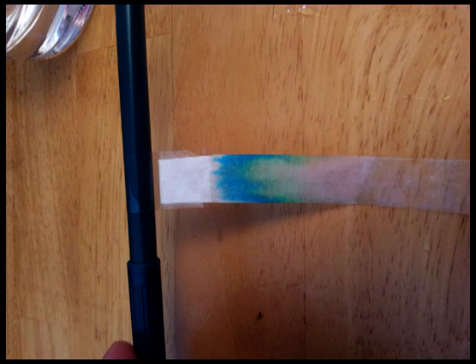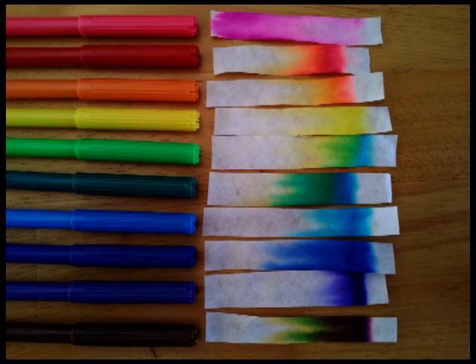You can let students have a go where each student or group has a different colored pen, just to see how it works. Then you can run it as a bit of a race - do it a second time, everyone gets ready, you say 3, 2, 1, go, and they pop it in the water. After about a minute and a half, maybe two minutes at the most, you yell out stop and see how far the ink has traveled up the paper strip.